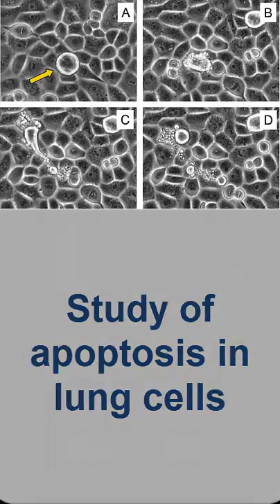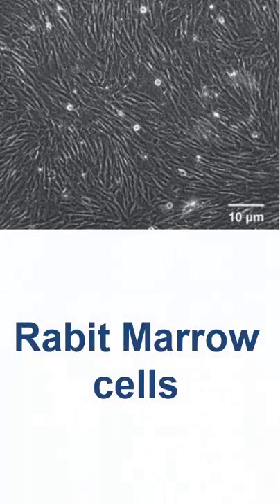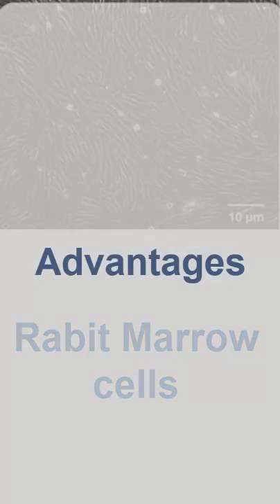Additionally, all microscopes have a limited working distance for focusing on the specimen. When using the inverted type, this difficulty is compounded by the reality of looking up through containers of various optical quality and thickness. You may look through plastic, which has much different optical correction than the thin glass cover slip on a standard slide used with a conventional microscope.